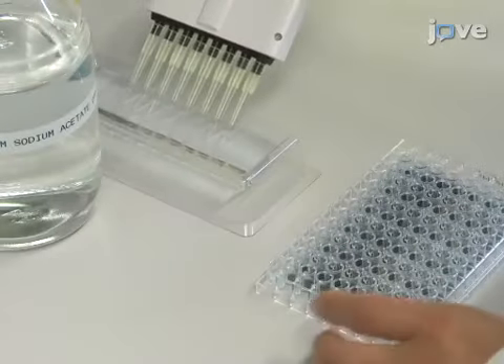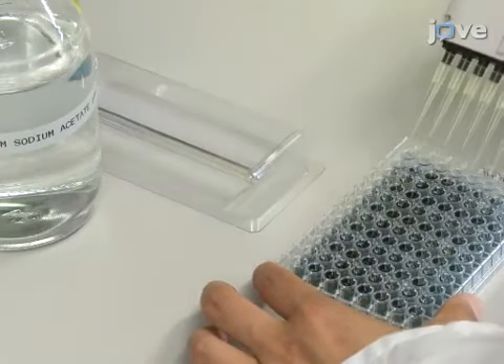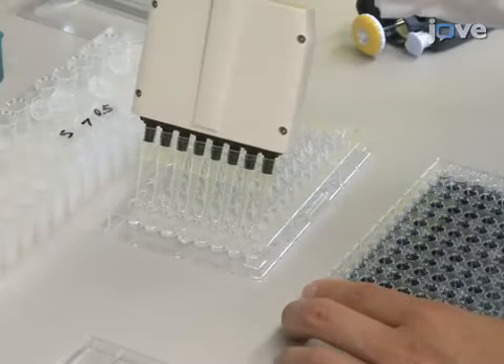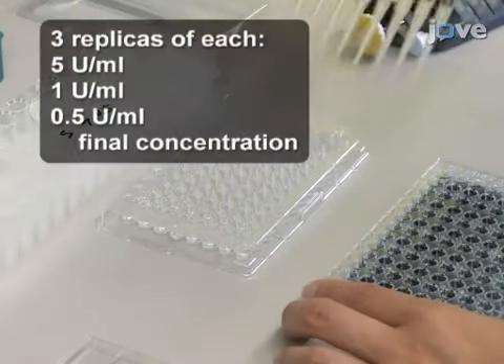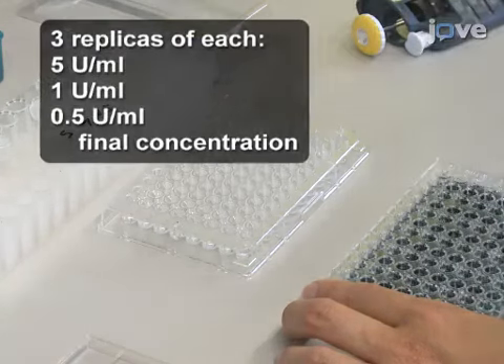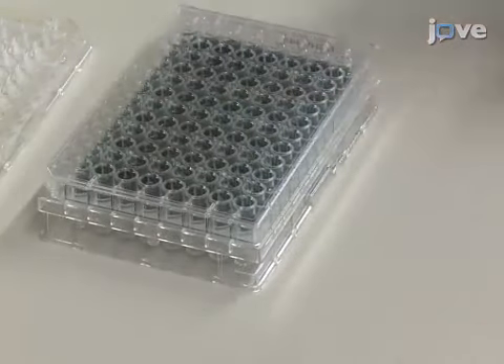To prepare the enzyme reaction, add 150 microliters of 100 millimolar sodium acetate buffer, pH 4.5, and 5 microliters of endocellulase solution with three different concentrations to each well of the assay kit plate. Place the product plate underneath the assay kit plate to collect any potential leakage from the reaction plate during shaking.